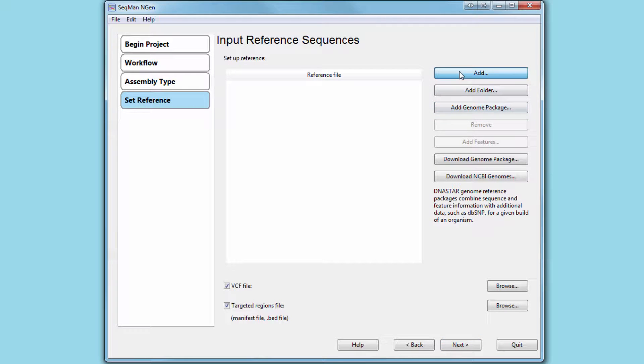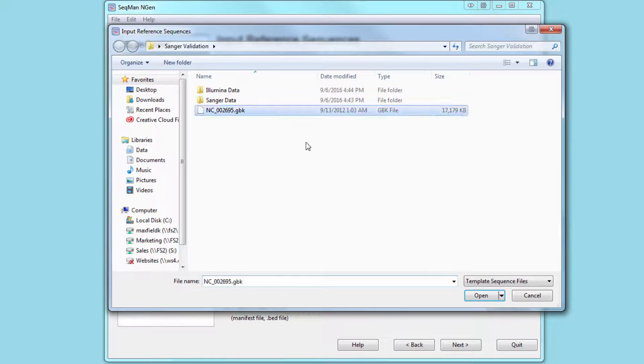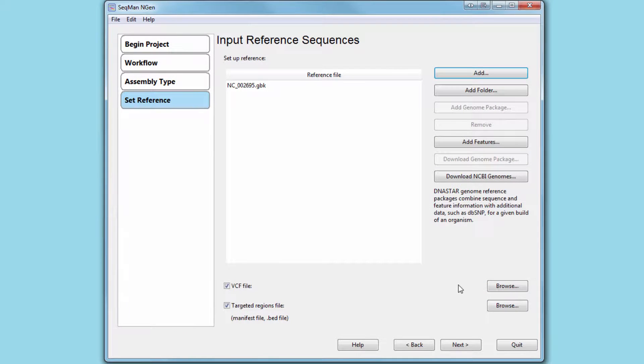In this example, I'm working with E. coli data, and I'm going to use a GenBank file as my reference. You may also wish to use one of our genome template packages.